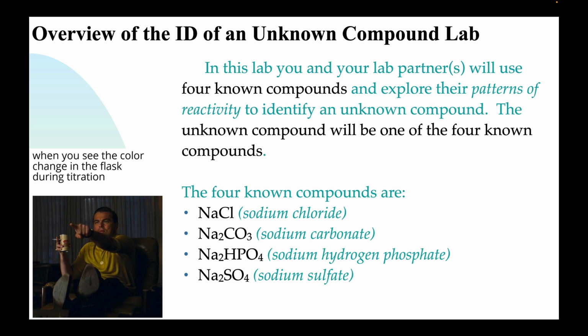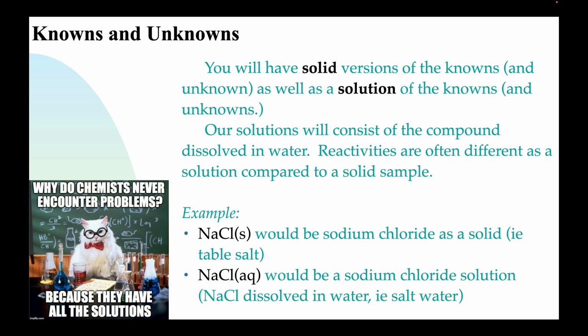your unknown compound. In this lab, you're going to have solid versions of the knowns and a solution version of the knowns. And of course, along the way, you'll also have solid and solution versions of your unknowns. Now, a solid is pretty chill. It's just a solid, like table salt is a solid. But if you take table salt and put it in water and dissolve it, your solid goes away. But of course, if you taste it, it would taste salty, like salt water.